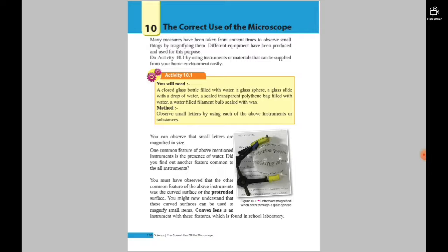Yes, what is that? You must have observed that the other common feature of the above instruments was the curved surface or the protruded surface. You might now understand that these curved surfaces can be used to magnify small items. So what do we have here? A curved surface. That's why, can you see in the picture, the letters are curved.